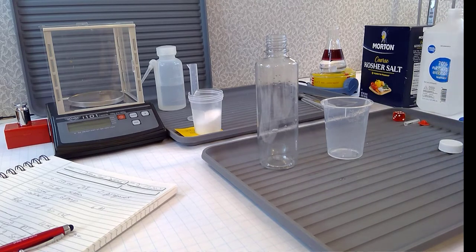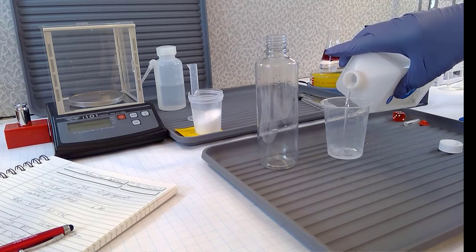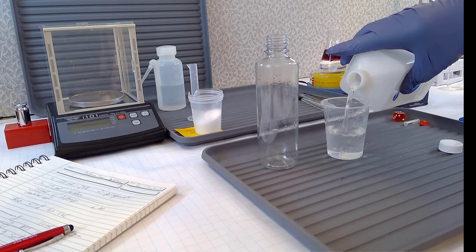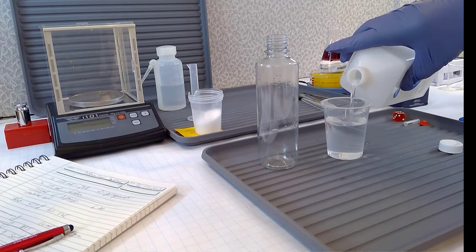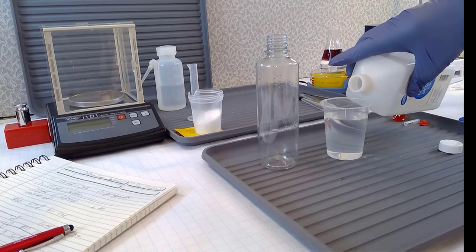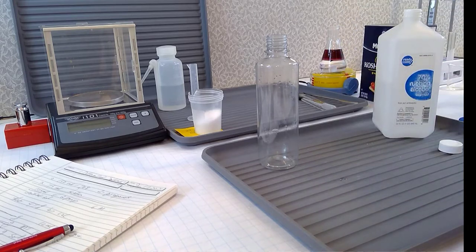I'm going to fill it up to the 150 mL mark. It's a little bit more viscous than water. It's hard to notice, but it is almost oily, but it evaporates very well, and it leaves no residue behind. That's why it's used very often as a solvent. And it evaporates relatively quickly. Let me see, I'm at the 150 mark.